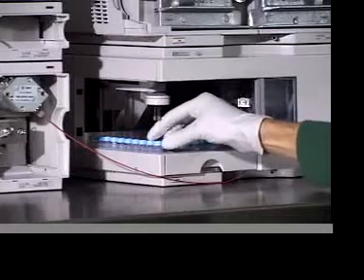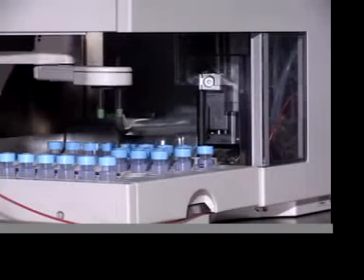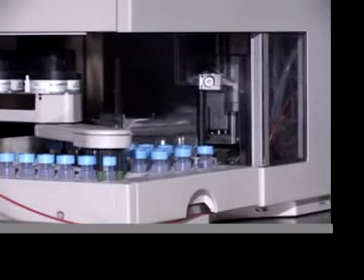At this point, we turn to fancier equipment. The mass spectrometer determines the molecular weight of our compound.